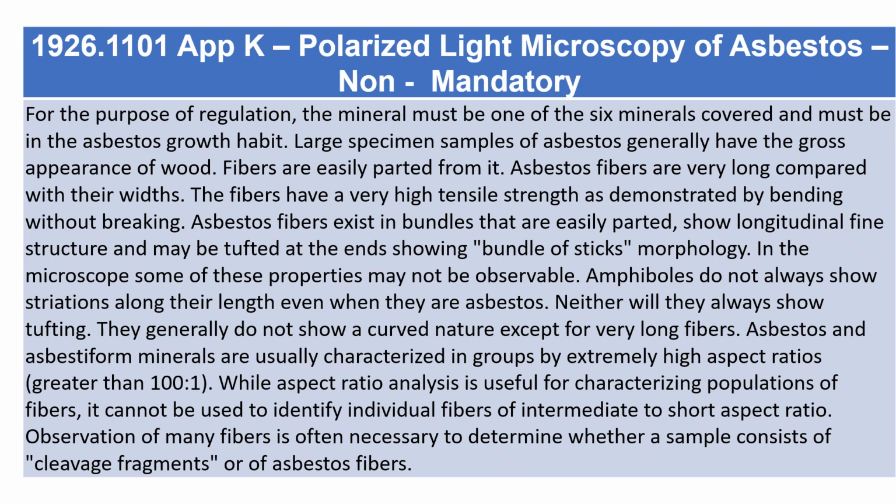Asbestos fibers are very long compared with their widths. The fibers have a very high tensile strength as demonstrated by bending without breaking. Asbestos fibers exist in bundles that are easily parted, show longitudinal fine structure, and may be tufted at the ends, showing bundle of sticks morphology.